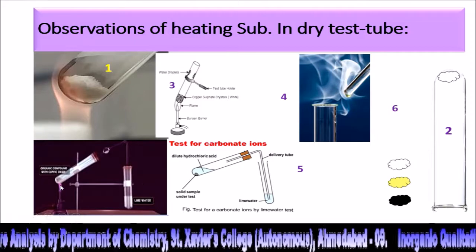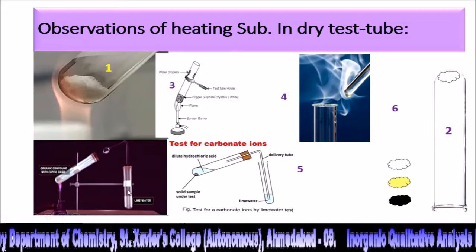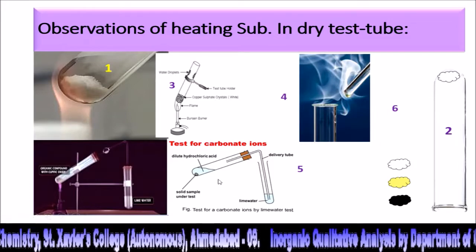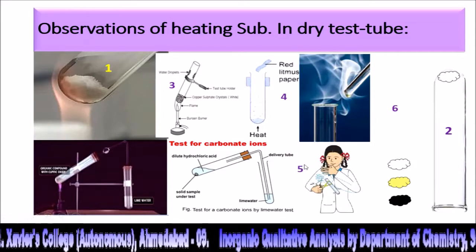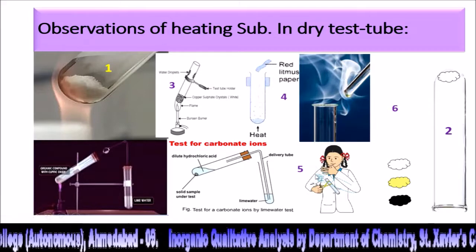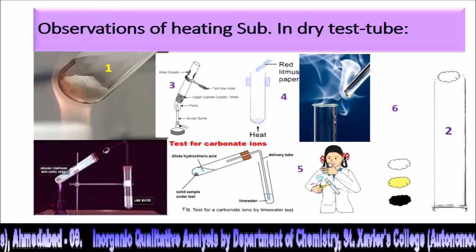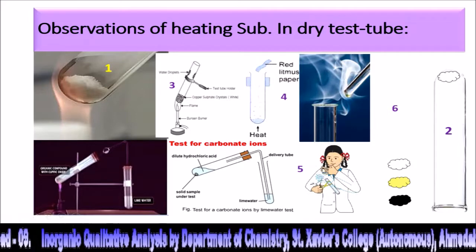And for colorless gas evolution, if the gas is passed through another test tube which contains lime water, and if that lime water turns milky, we can say that the colorless gas is carbon dioxide. That way, you can smell the compound, but we will not advise you to smell. If you want to smell, you can wave your hand like this and push the fumes to the nose rather than keeping your nose at the mouth of the test tube. That way you can smell the compound.